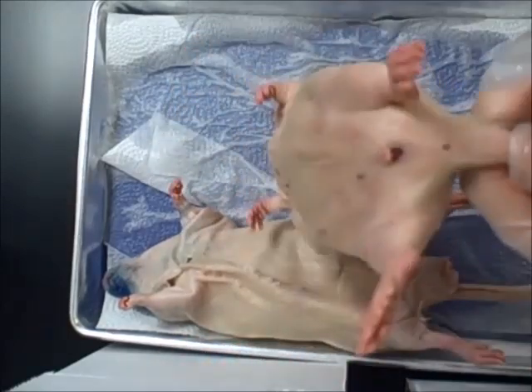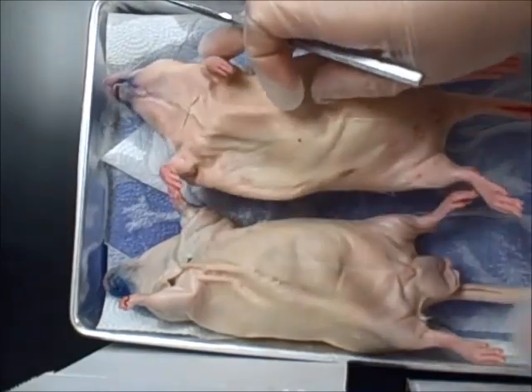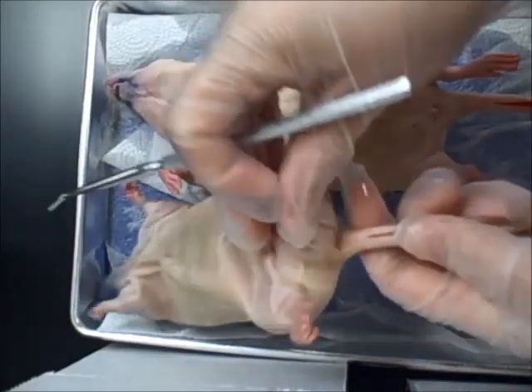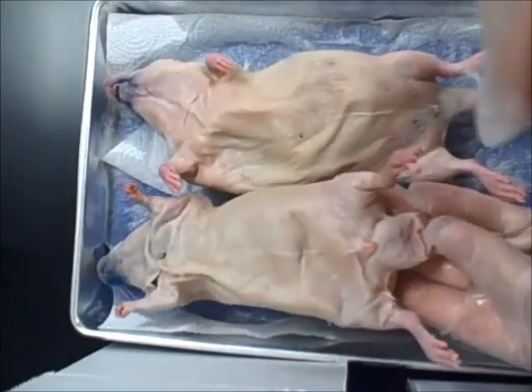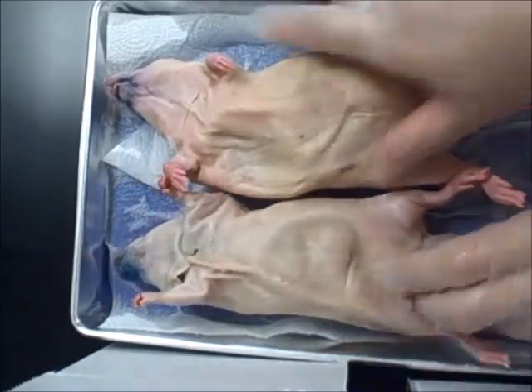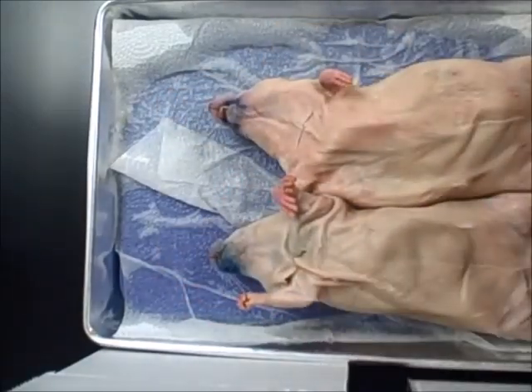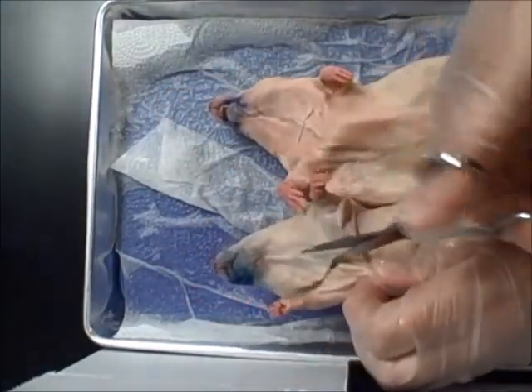But the female also has another opening, and that's going to be the vaginal opening. The male only has the one opening, the anal opening under the tail, and then the scrotal sacs with the testes. So for the dissection, we're going to open up the rats.